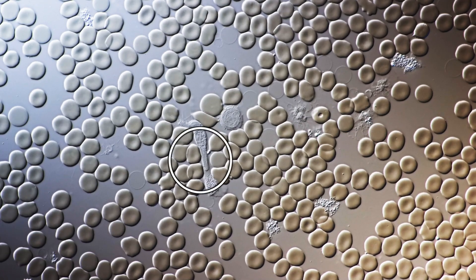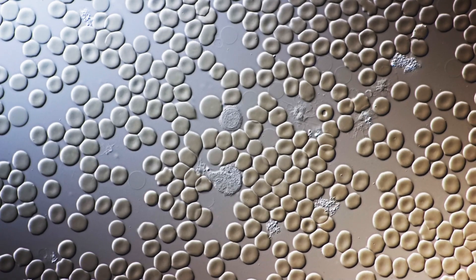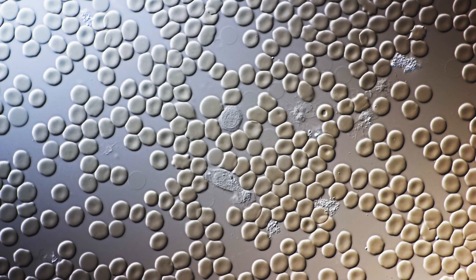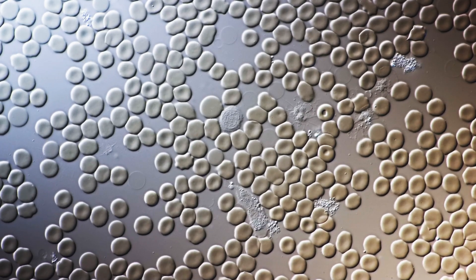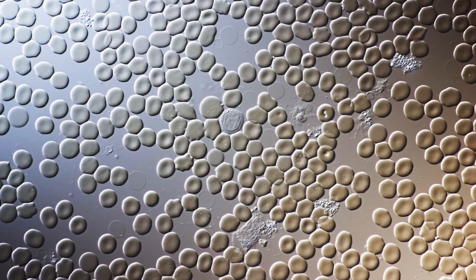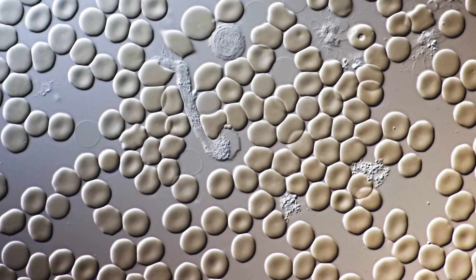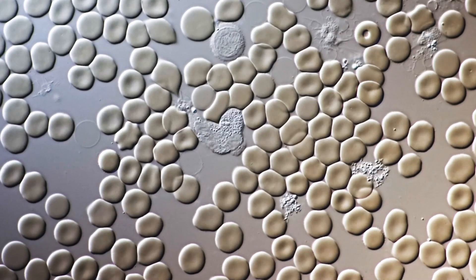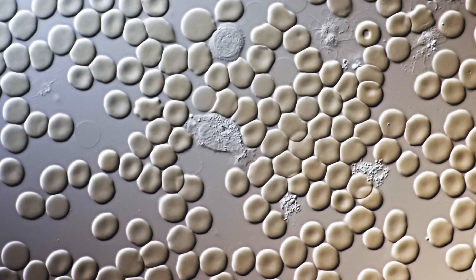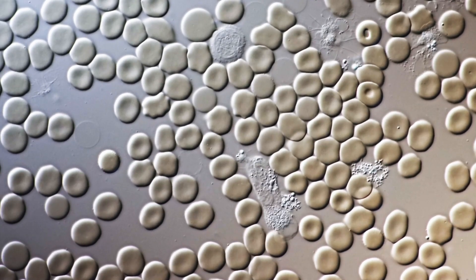When you put a drop of blood under the microscope, the red blood cells are very abundant. Most of the cells you see here — those round disc-shaped, donut-shaped structures — are red blood cells. They are important for carrying oxygen. But the white blood cells are important for our immune system because they fight diseases and are able to eat pathogens — disease-causing microorganisms like bacteria. Some white blood cells are also important for removing and cleaning up dead body cells, essentially recycling dead cells and bacteria inside our body.